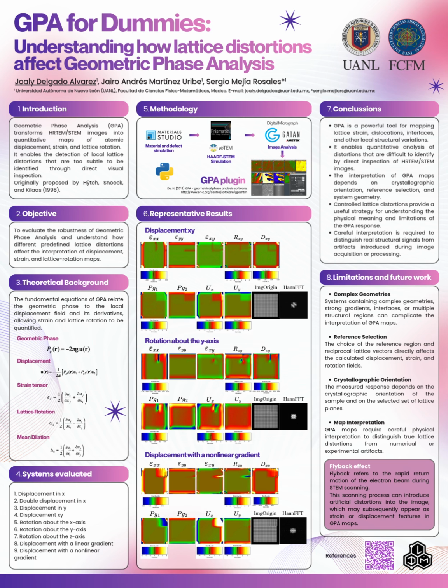Overall, GPA should not be treated as an automatic strain measurement method. Reliable interpretation requires a combination of crystallographic knowledge, careful image processing, and comparison with controlled models or simulations.